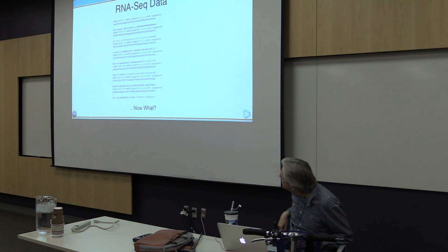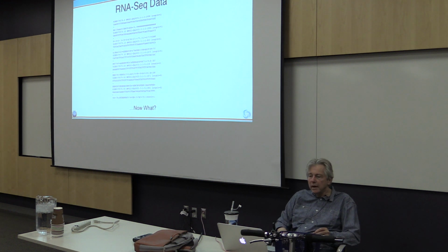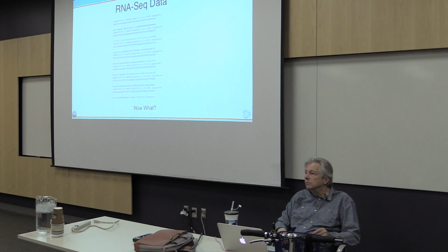in hexadecimal format, from my understanding, and then you're back to the next read name, and it just does it over and over again. And you may have millions of reads in a file.